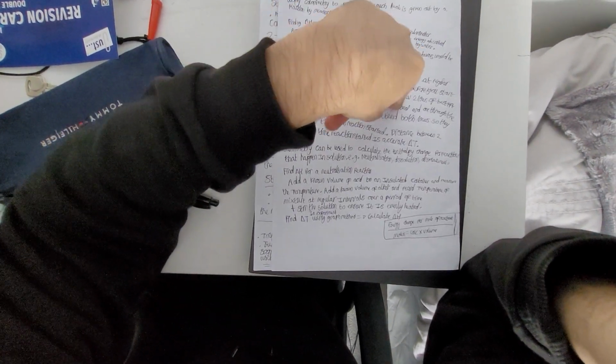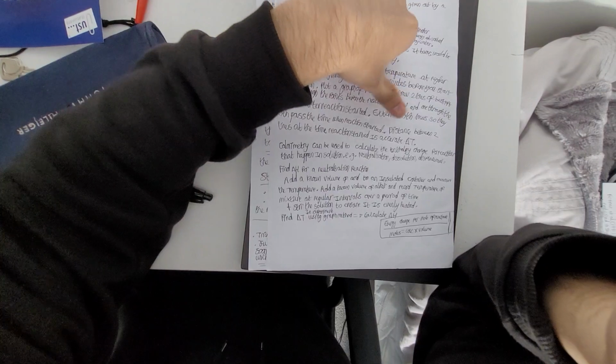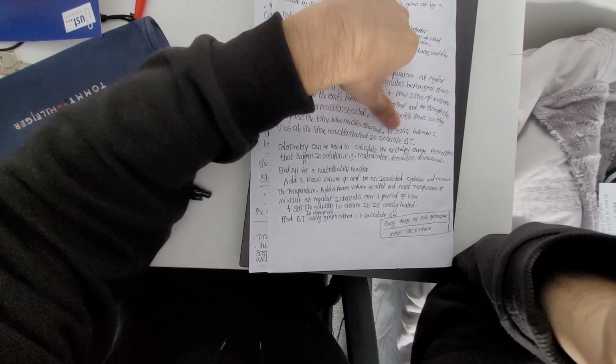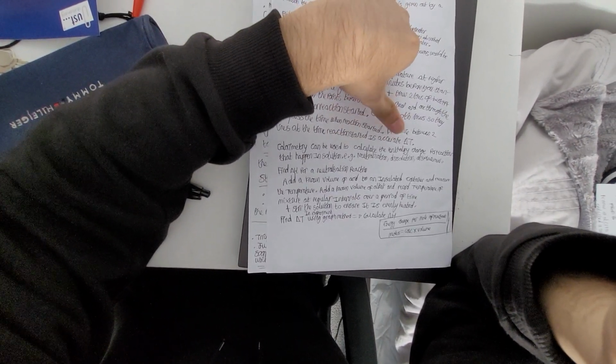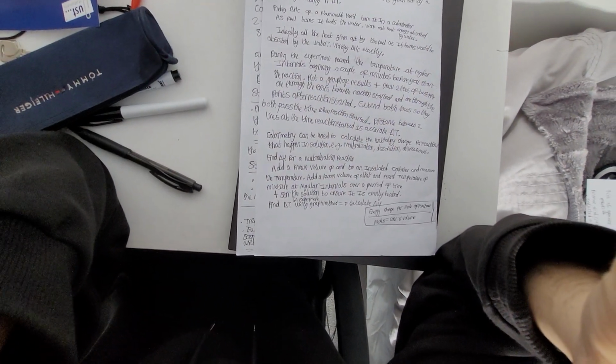That's the graph method. Plot a graph of results, two lines of best fit, one through the points before the reaction started, one through the points after the reaction started. Extend both lines so they both pass the time when the reaction started. The distance between the two lines at the time the reaction started is the accurate temperature change. That's the graph method. And here's another one.